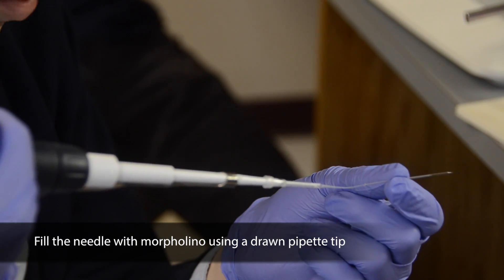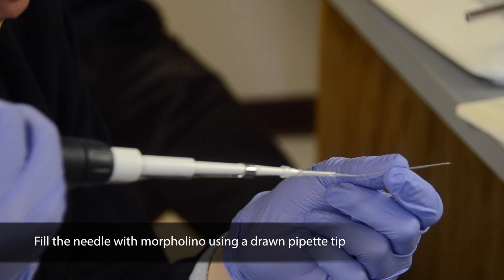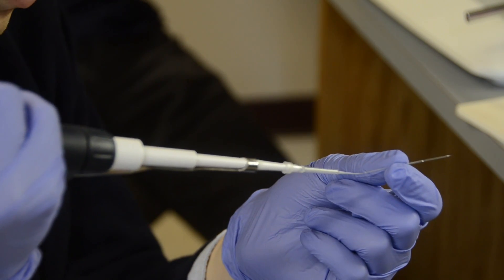The first step of microinjecting is to load your needle with Morpholino using a thin drawn pipette tip. Make sure there are no bubbles in the needle.